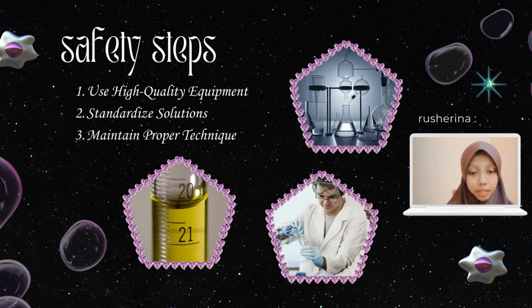Lastly, maintain proper technique. Follow proper titration techniques such as slowly adding the titrant drop by drop near the endpoint, swirling the solution gently to mix, and ensuring proper reading of the meniscus.